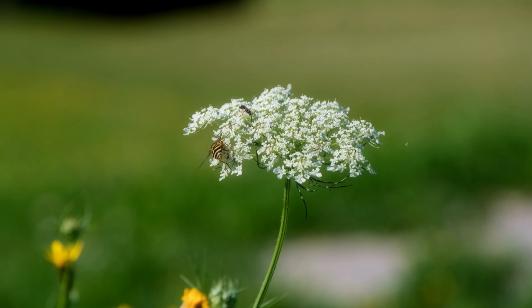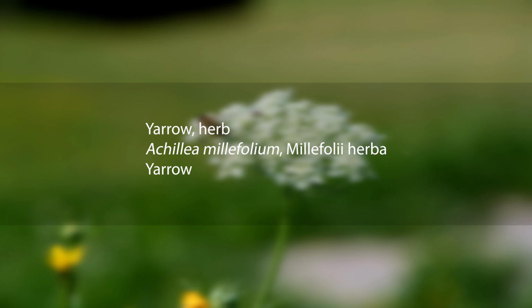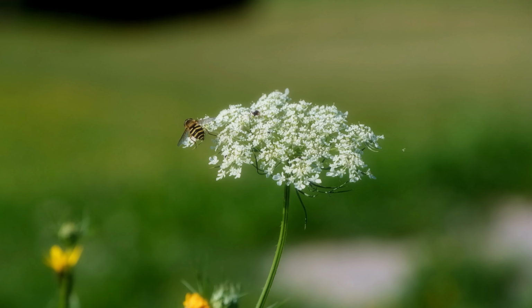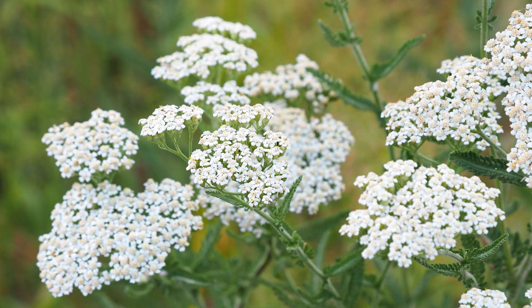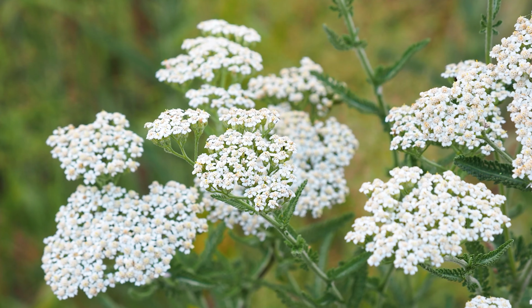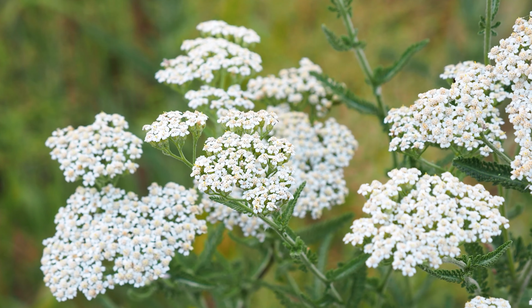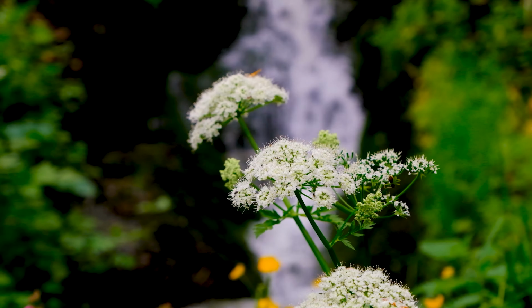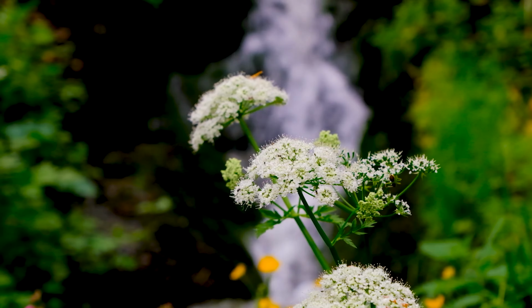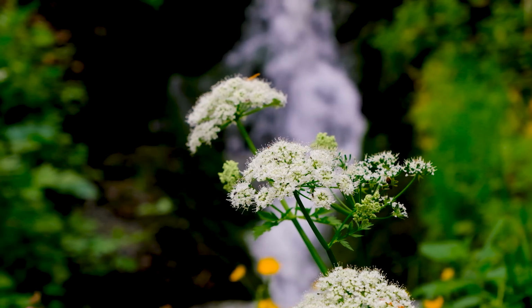The first chemical test will confirm the identity of the herbal drug yarrow, which is called Millefolii herba in Latin. The European Medicines Agency states in the monograph of yarrow herb that it is used to treat loss of appetite, mild abdominal problems such as cramps, bloating and flatulence, mild menstrual cramps and minor superficial wounds. The main active substances responsible for the action of yarrow herb are volatile terpenes and terpenoids, that is, the components of essential oil, flavonoids and sesquiterpene lactones.